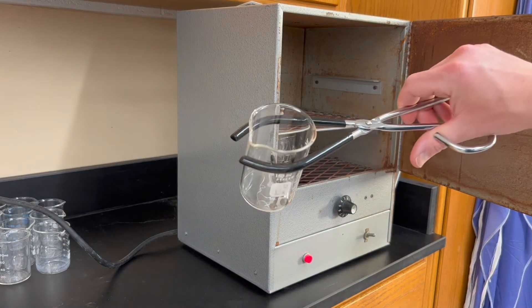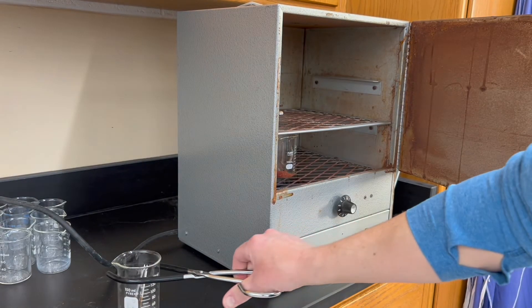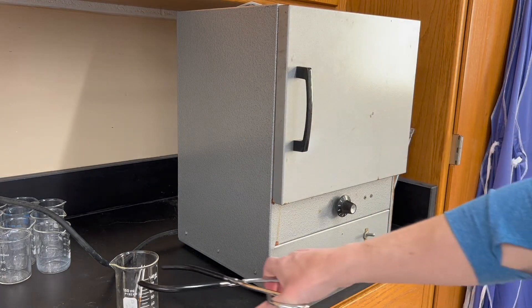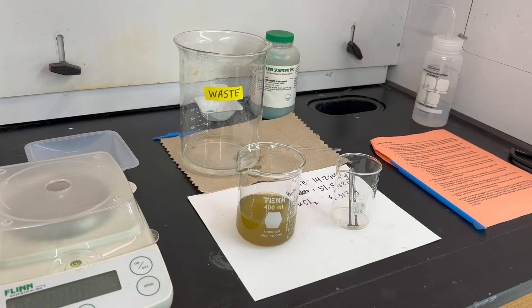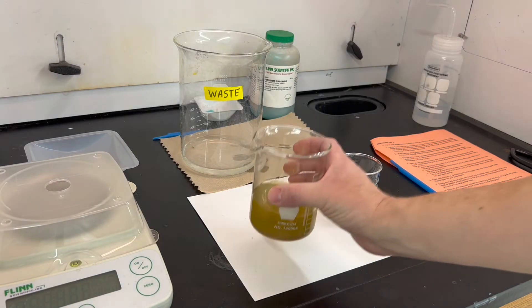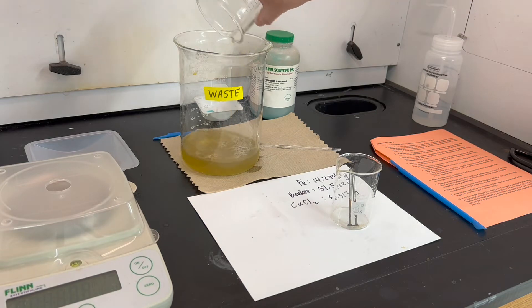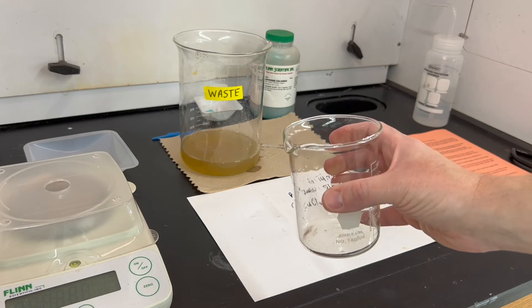The waste solution in your decanting beaker should go in the class waste beaker, and then that beaker can be cleaned, dried, and put back in your lab drawer.